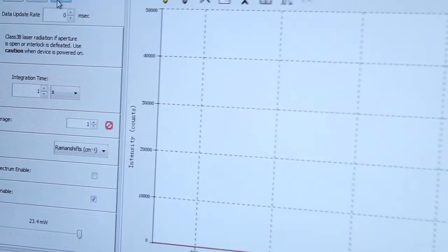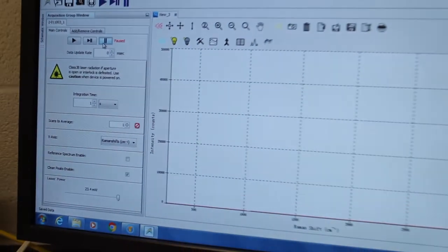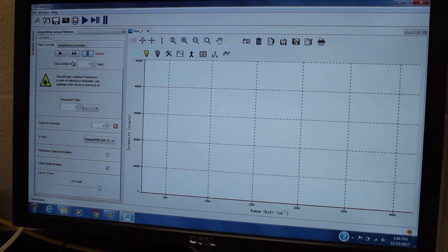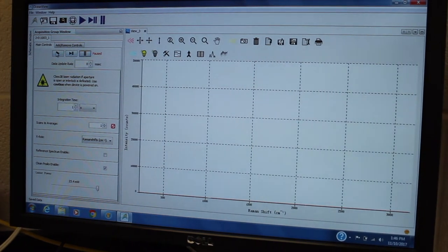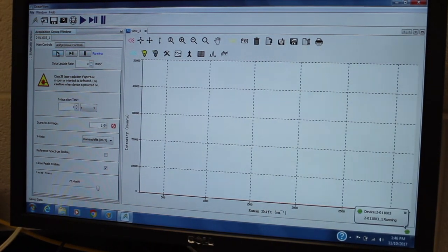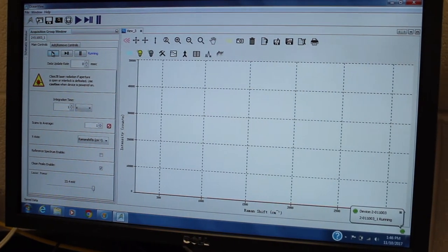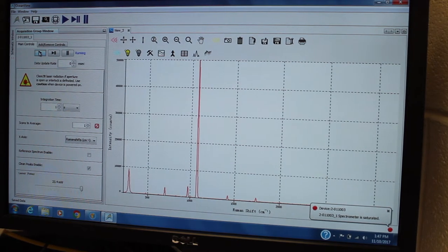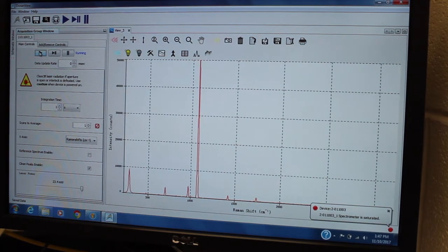And now I'm going to come back over here and run again. Now I have Raman peaks.